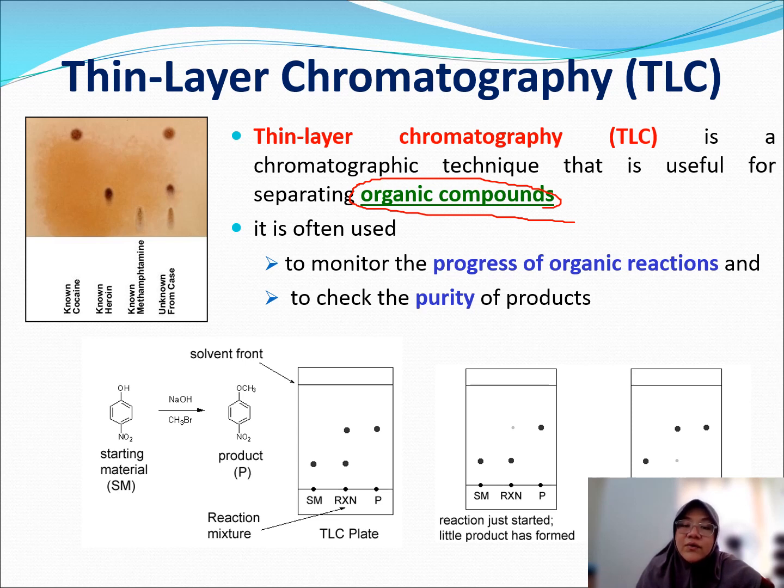It is also often used to monitor the progress of the organic reaction and to check the purity of your products, okay. In TLC thin layer chromatography, okay, using the TLC plate, on the plate, okay, dia boleh letak your sample, reaction mixture dan juga you punya standard, okay. You boleh letak standard to compare, because in the chromatography technique memang kita perlukan standard, okay.